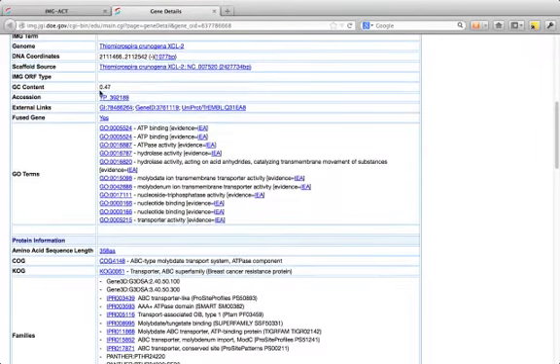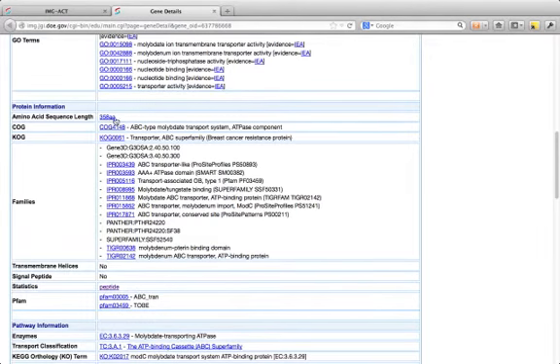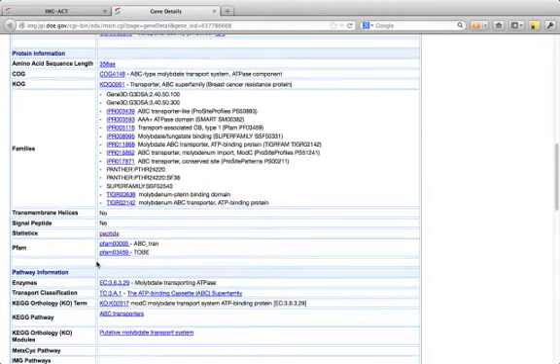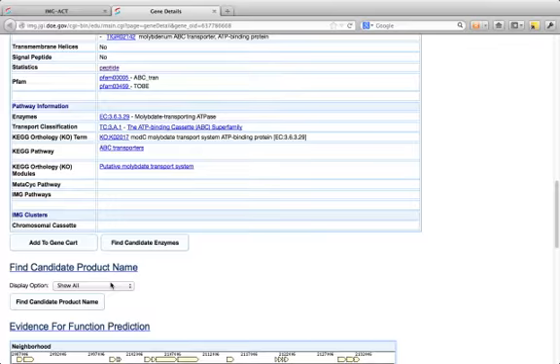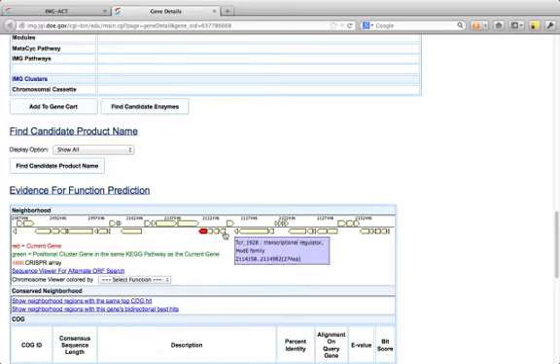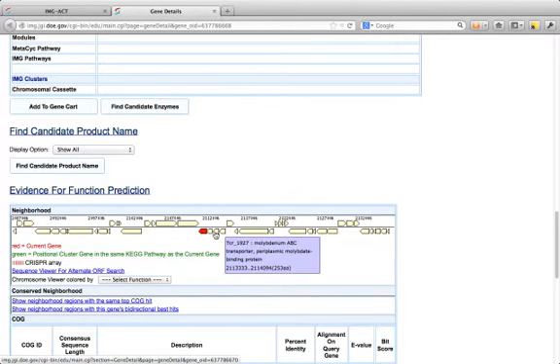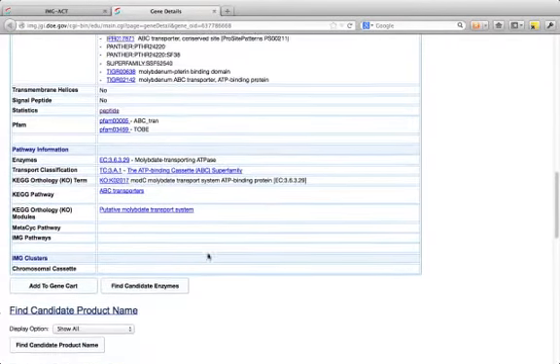annotation came from. The GC or guanine cytosine content of the genome, and all kinds of other pieces of information, including the amino acid sequence length. We're going to go here, and the peptide sequence length, another place we'll be going later on in the day. As we move on down, this is what I call the gene neighborhood. It's a very amazing mechanism for us to see how genes are potentially organized within the genome, and especially the idea that genes of similar function are organized and regulated in similar manners within the context of an entire genome.